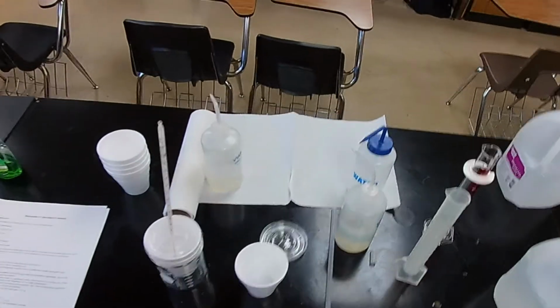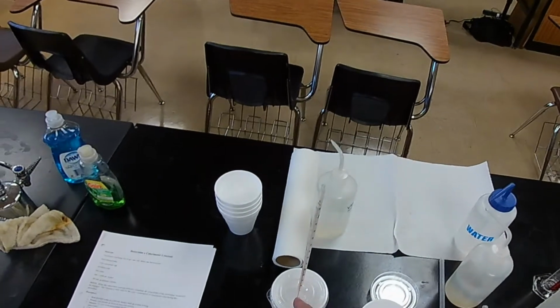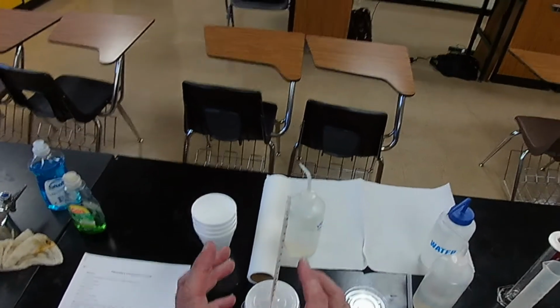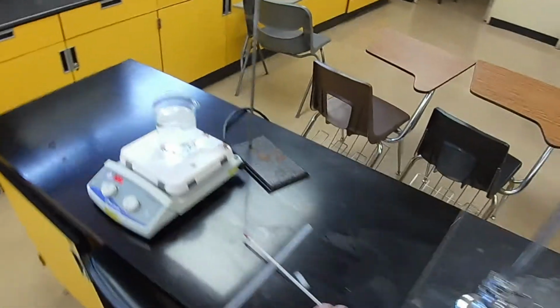Okay? So, this thermometer must stay with the calorimeter. This is an integral part of the calorimeter. You cannot change it. So that's why we need a second thermometer to measure the hot water.